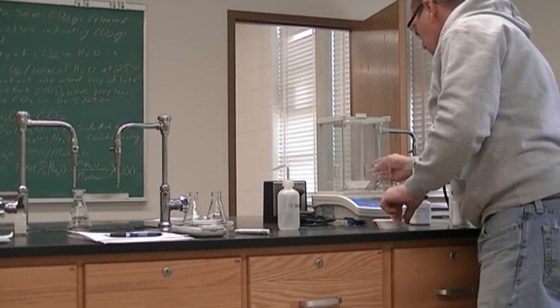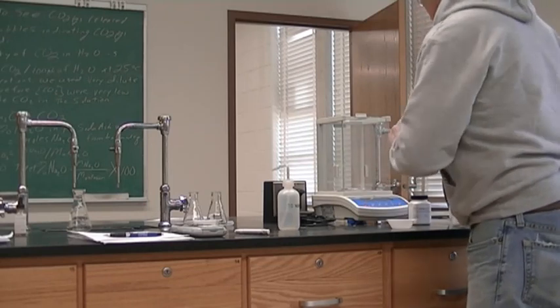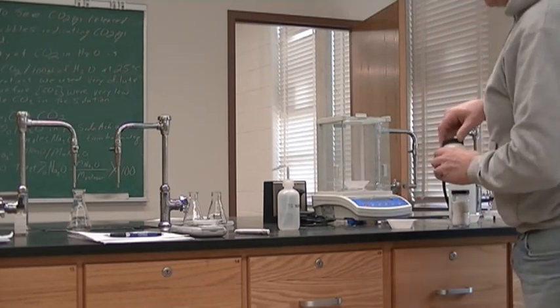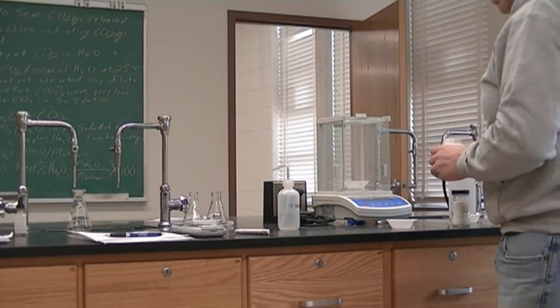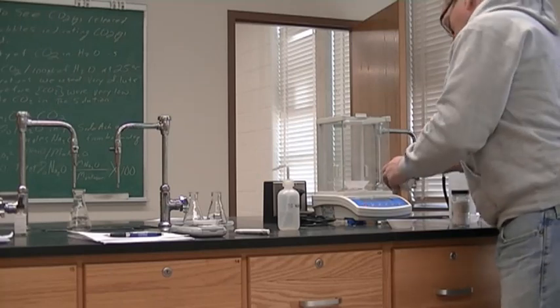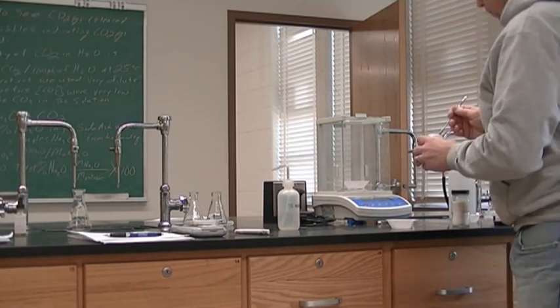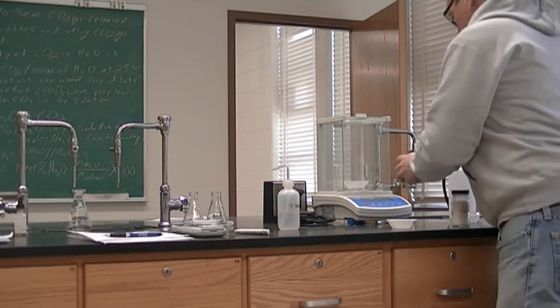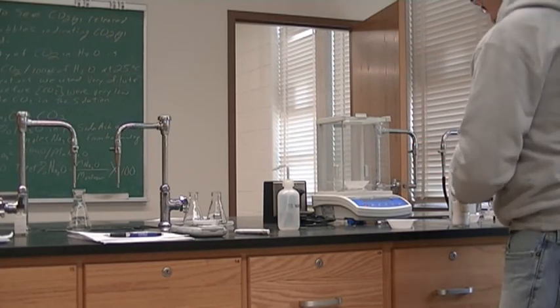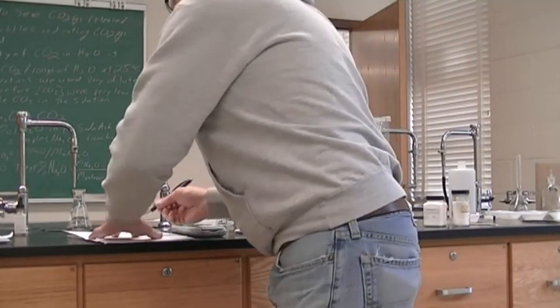And so I put in my weigh boat. Brand new weigh boat. All right, and I'm going to push the tare. And I want a good amount, would be in the 0.2-ish area. All right, let's try that. It's a little higher than the other ones. 0.2245.